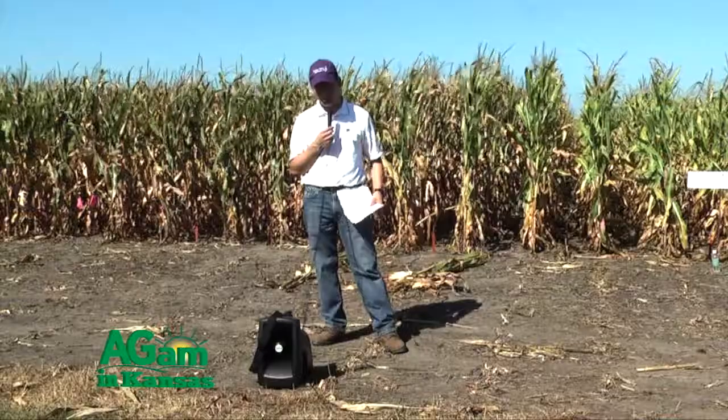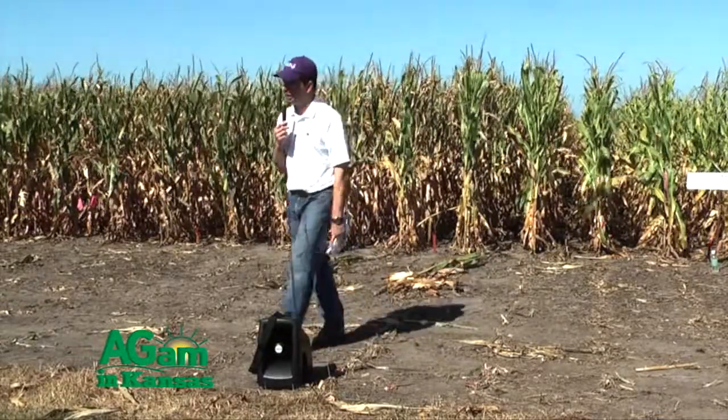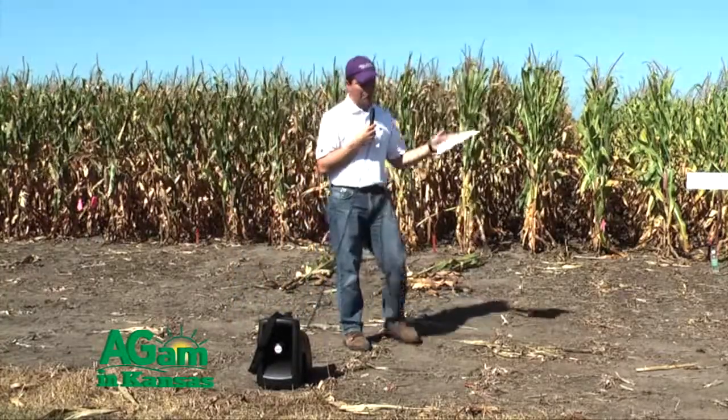Welcome back to That's My Farm. With us we have Dorival Ruiz-Diaz, our soil extension specialist and director of the soil testing lab. We were talking just before the break about the calibration studies you do around the state, and many of them over many years. Tell me how you do the increment. How do you know where you get that response?